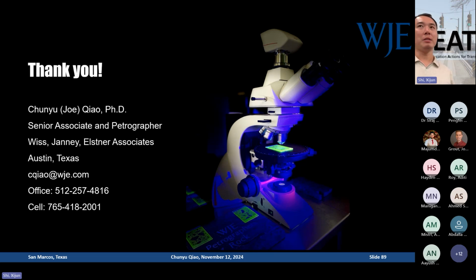And other than that, maybe just very small accessories, the needles for different Mohs hardness or a color chart. You need a good camera to capture the images you want to take from the microscopes. I think that's basically what a petro lab needs for study. Okay, and do you have a rough number, how much investment, just roughly? Oh, that range varies, because each piece of equipment can vary so much in quality and accuracy.